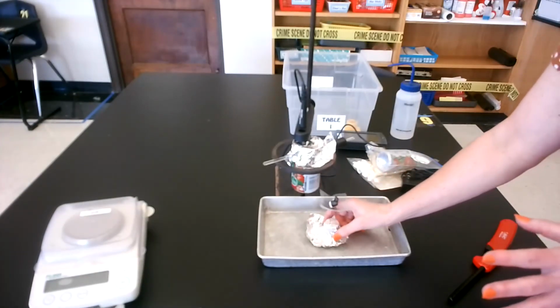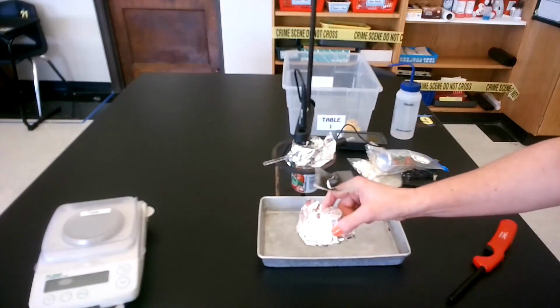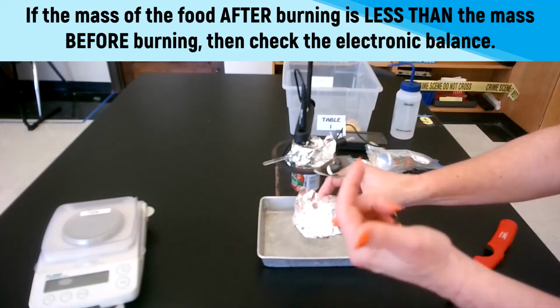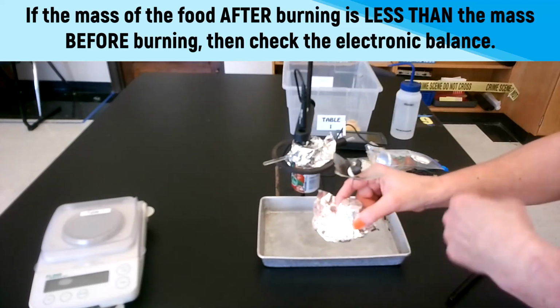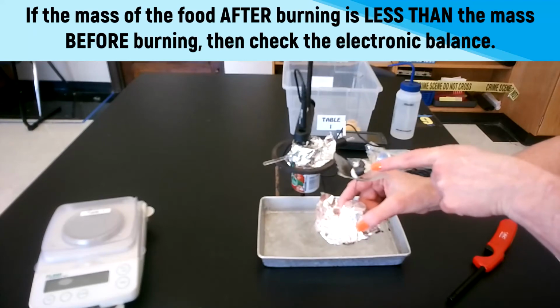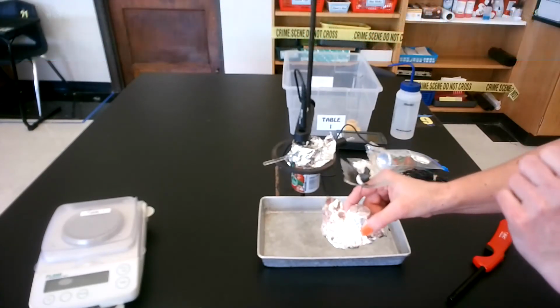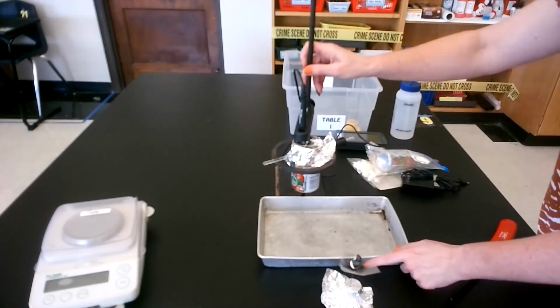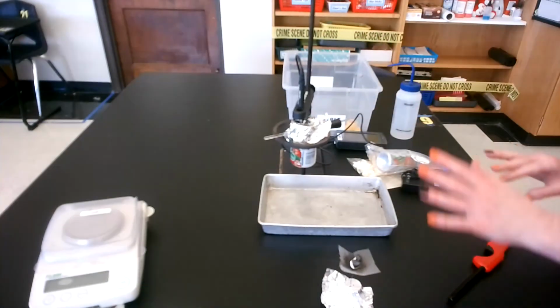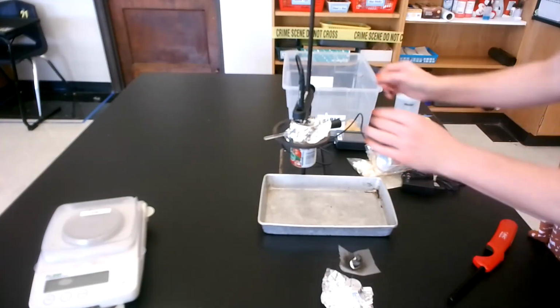When I'm done, I'm going to go back to my electronic balance. I'm going to find the mass of all of this burnt food and food holder. I will subtract the food holder from the food after it's burnt, because some may be stuck to my screen. Then for cleanup, I'm going to disassemble all of this, and then I'm going to do my second food with the same setup.